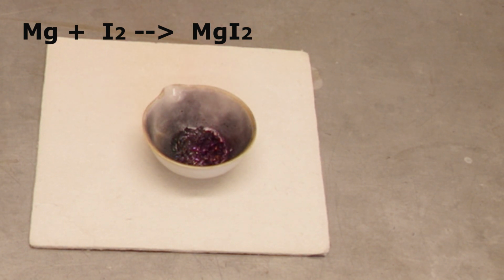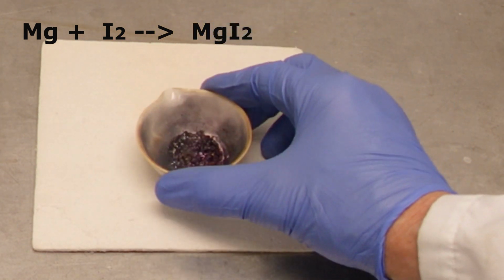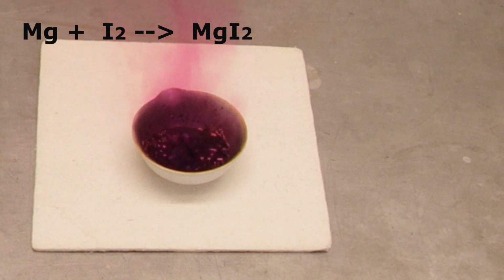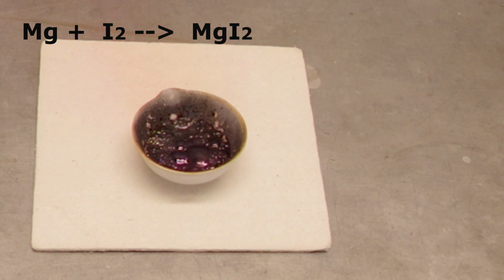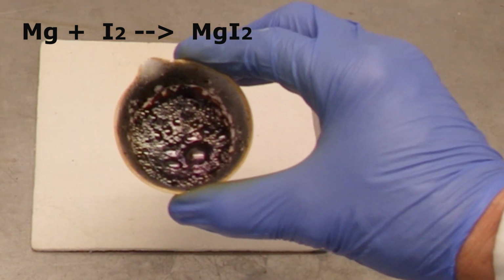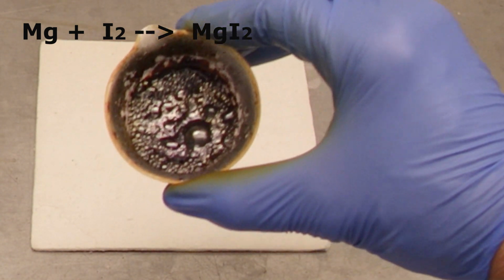The reaction seems to have stalled out again. The crucible is not hot to touch. I'm going to try more water still. Well, that's looking better. So magnesium iodide is a white crystalline solid. All I see is purple-black goo. That's likely the excess iodine that's present. So there's the reaction of a metal, magnesium, with a non-metal, iodine, to produce a metal, non-metal salt, magnesium iodide.